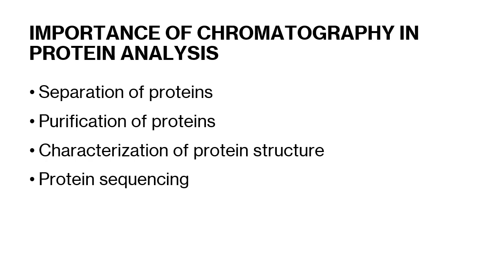Let's take a look at the importance of your chromatography in protein analysis. No? And so your chromatography can be used to separate your proteins, separation of your complex protein mixtures into their individual components based on, of course, their unique properties. No, and so this one is critical in studying and characterizing proteins present in a biological sample. No, and so that is for your separations again.